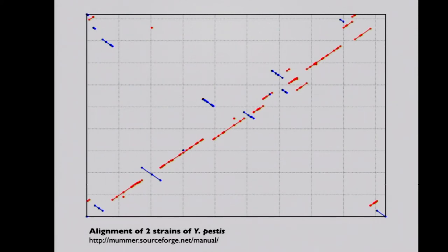So what happened here? Inversion. Yep, kind of walked along here. Another inversion, kind of walked over here. What do you think happened here?